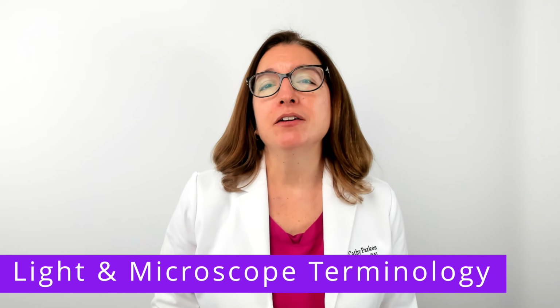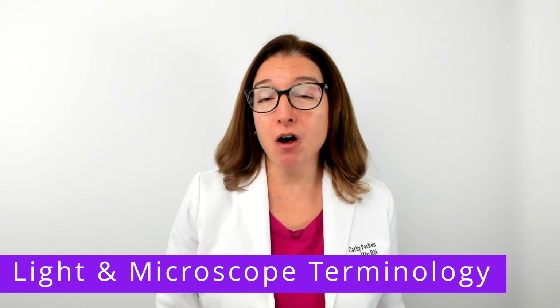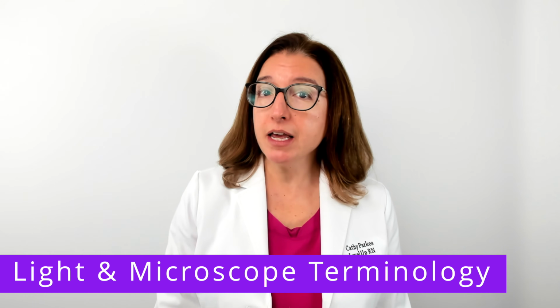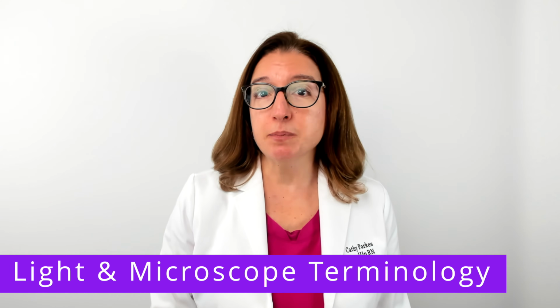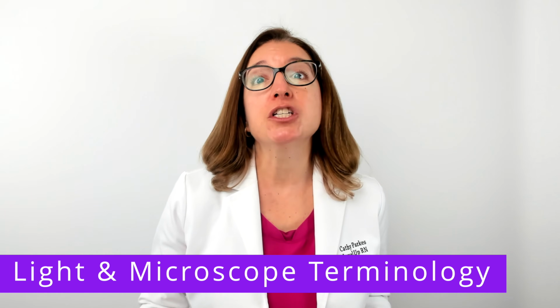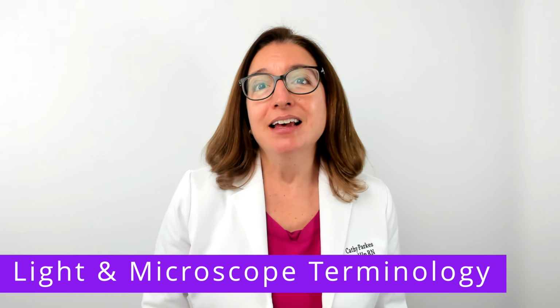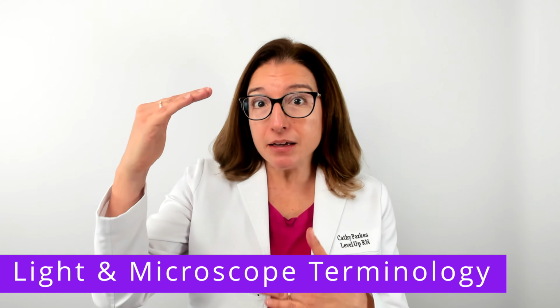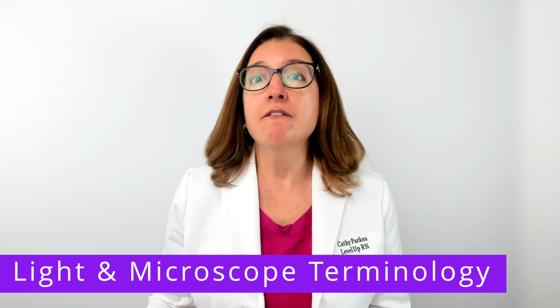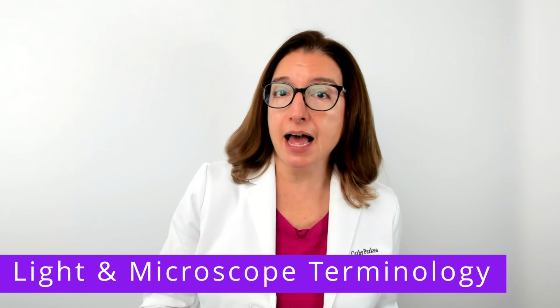When using a Brightfield microscope, which is the most common type of microscope, when light rays pass through the air between the lens and the specimen, the air will scatter the light rays, which decreases resolution. This is because there is a big difference between the refractive index of air versus the refractive index of glass.